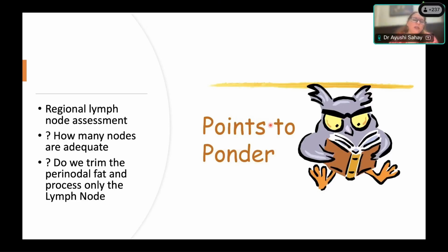If it is a properly surgically excised axilla, you are going to have a lot of nodes. So that is only in post-chemo status that you might not get that many nodes, because they become shrunken. But in a properly good size axillary clearance, there are generally 15 nodes, but a minimum of 10 is considered sufficient.